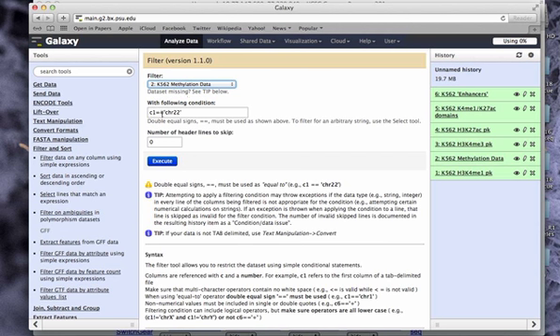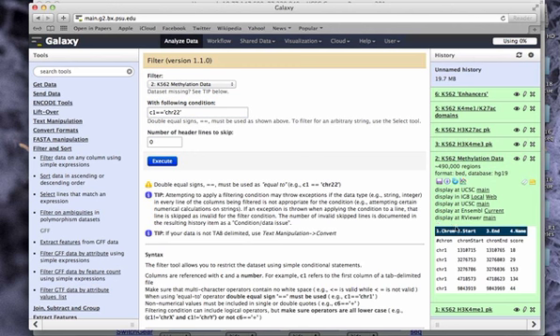And so by regular expressions, it means that you can put in some sort of text as long as it's delimited by or denoted by these two tick marks. And when it's saying here C1, we're talking about the different columns that you have. So in this case, this is C1, C2, C3, C4. And so we say we want, from our methylation data, column 4 that is greater than or equal to 200. And then this is going to be our methylated regions. So we'll just skip the header line that we have here. This is the header line that we're talking about. And we can get that going.